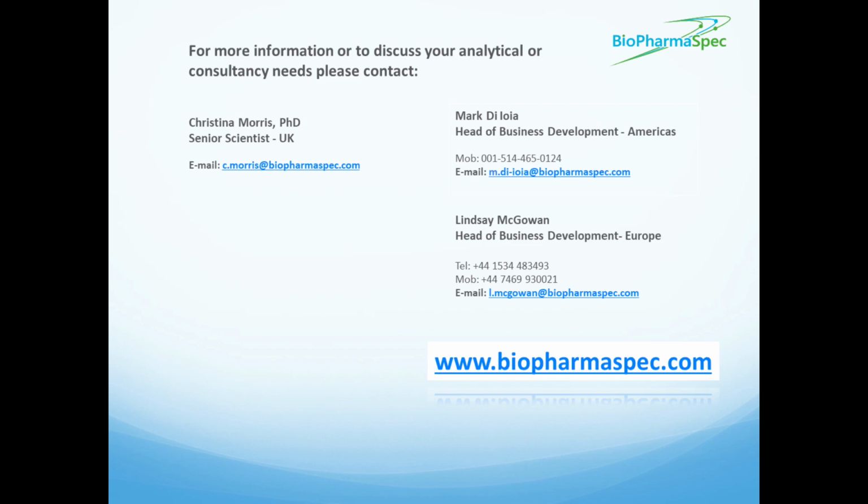As submissions with off-the-shelf ELISA kit data and MS data are only just going in front of the regulators, I suspect the need for a product or process-specific ELISA will depend on the coverage from the commercial kit across the HCPs. So if this is high, then the commercial kit plus the HCP MS data will probably be enough. But if the commercial kit ELISA coverage is low, then you'll probably need a specific ELISA plus the MS.